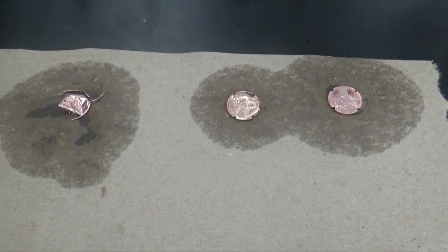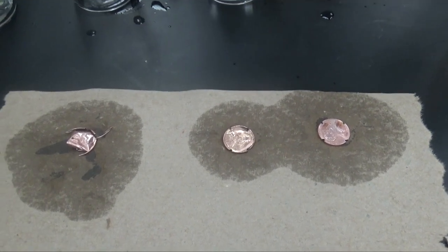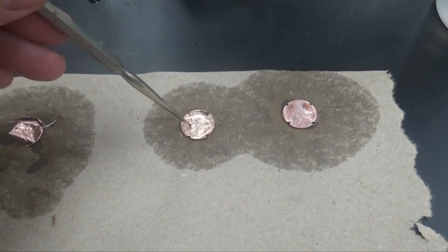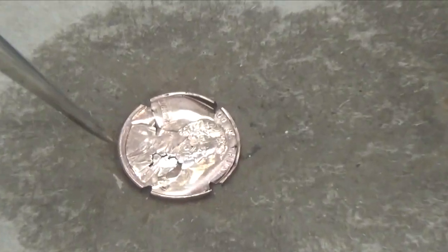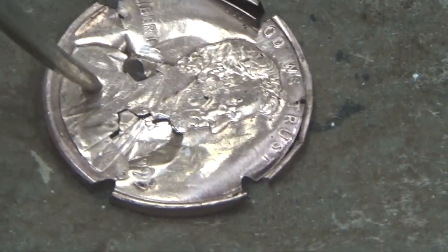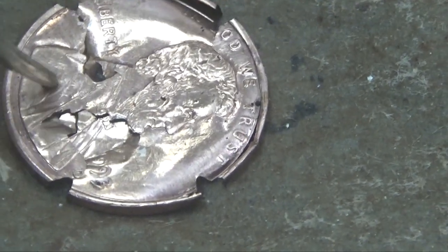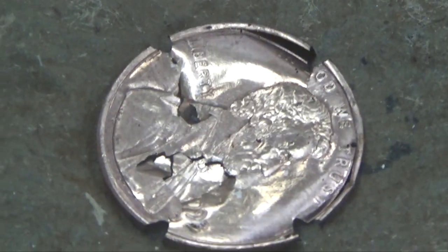Okay, now I've rinsed all of the pennies from group A with distilled water, and what I want to do is look at that middle penny that was floating earlier. I noticed that most places of this penny are kind of foil-like. However, in the middle there's a hard ridge that contains some zinc. So I'm going to have to put this penny back into the acid for about another hour.